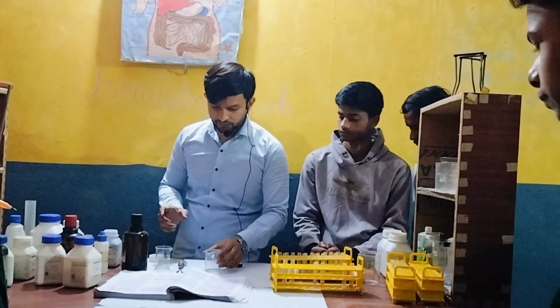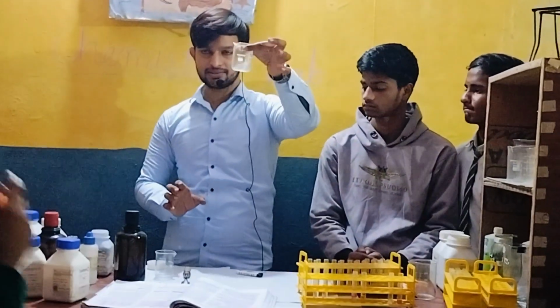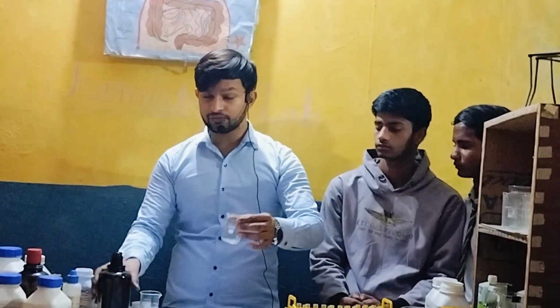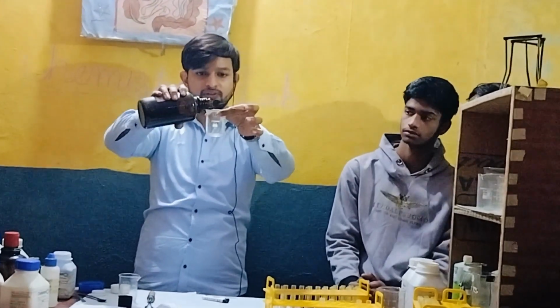Okay, so let's perform the experiment. I have taken the base into this container, that is NaOH. Now let's see what will happen when I add acid to it. Please observe everyone carefully.